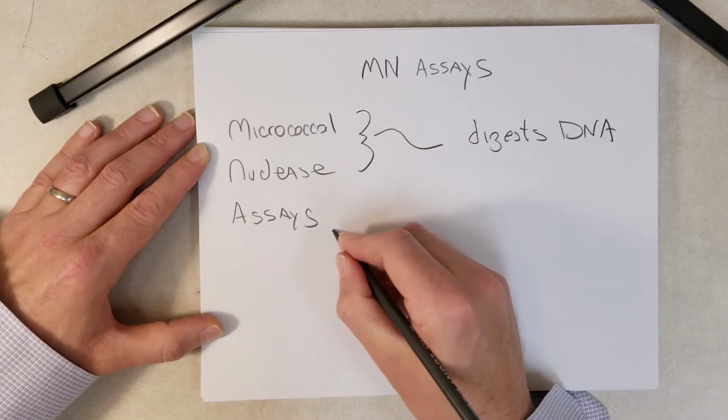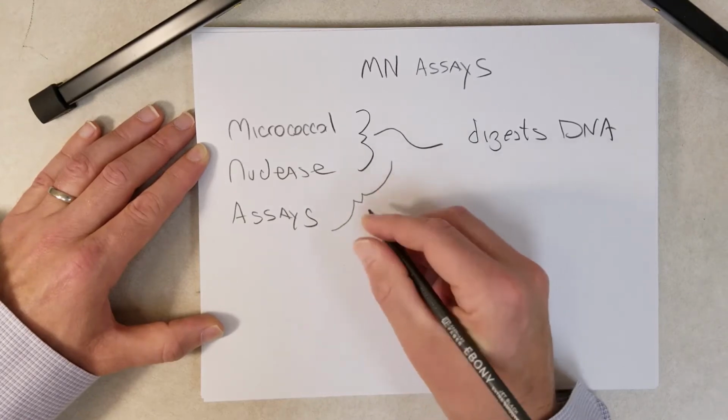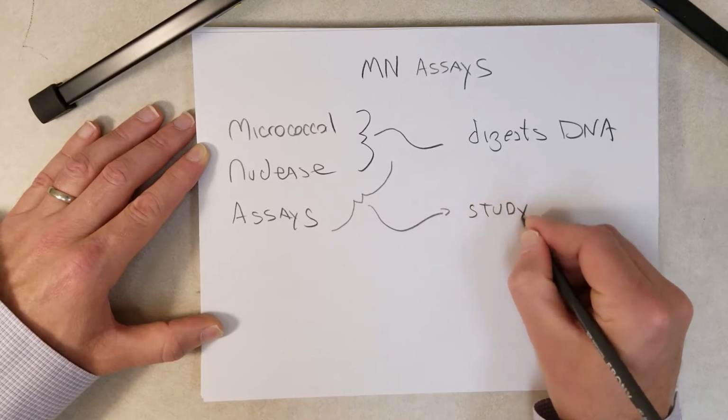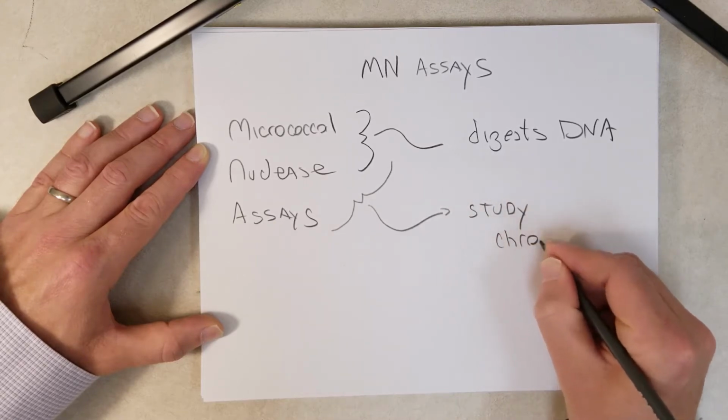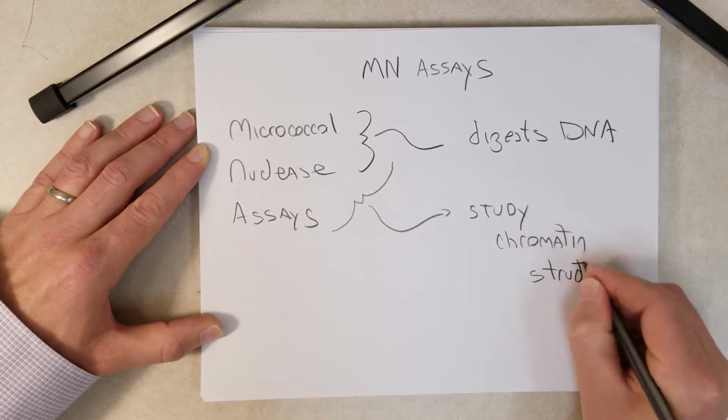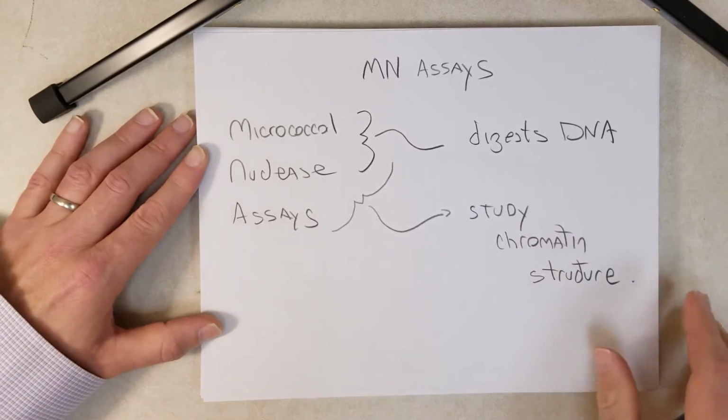Now, a micrococcal nuclease assay is a technique that is used to study chromatin structure. Okay, so a little review on chromatin.